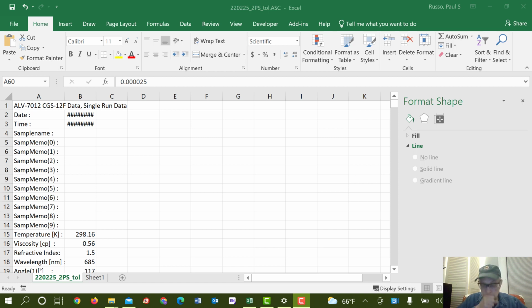The other purpose is to demonstrate for some collaborators who are looking into the artificial intelligence way to analyze data. And in that project we're sort of hoping that we can just look at these plots and say it's good or it's bad, it's been dusty or it's not dusty, whatever. So we're going to focus mostly on the correlation functions itself. What to do with the intensity data is pretty obvious if it has sudden spikes in it, intensity as a function of time, and that's not a good thing.